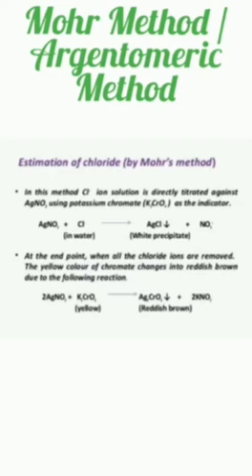Here, a white precipitate of silver chloride formed. At the end point, when all the chloride ions are removed, the yellow color of chromate changes into reddish brown due to the following reaction. 2 silver nitrate plus potassium chromate gives silver chromate plus 2 potassium nitrate. Here, a reddish brown precipitate of silver chromate obtained.